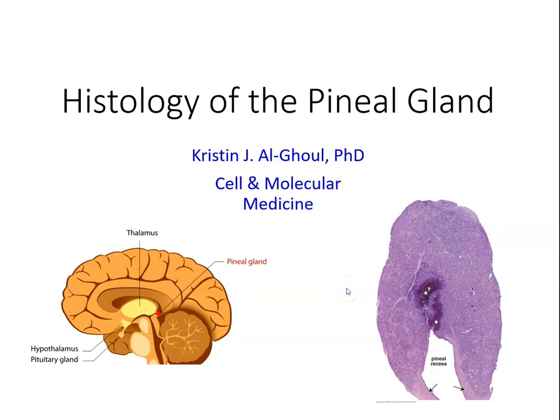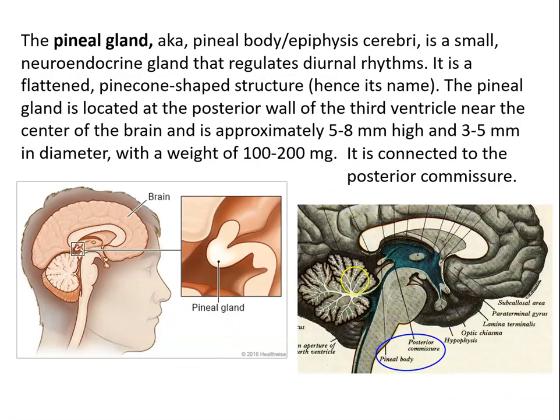This video will cover the histology of the pineal gland. So the pineal gland, also called the pineal body or the epiphysis cerebri or just epiphysis, is a small neuroendocrine gland, and it regulates diurnal rhythms. In shape, it's a flattened pine cone shaped structure, hence its name pineal.